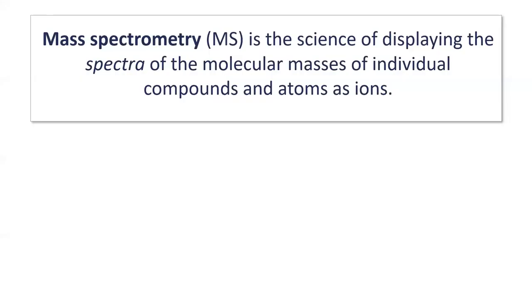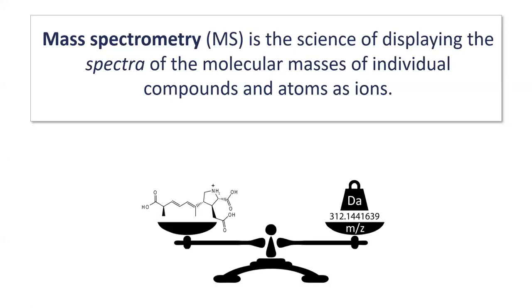First of all, what is mass spectrometry and why is it so important? One thing we always need to keep in mind is that we measure ions. We measure ions with mass spectrometry, and this is why you can see the scale here. And what does the mass to charge ratio mean? If we combine mainly carbon, hydrogen, nitrogen, and oxygen, we get this chemical formula, which, if we compute it to the neutral mass, is equal to the compound that you see on the left side as well.